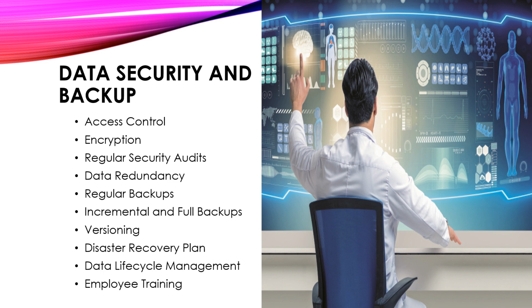Disaster recovery plan. Develop a comprehensive disaster recovery plan outlining procedures for restoring data and system operations in the event of a disaster. Test the disaster recovery plan regularly to ensure its effectiveness.